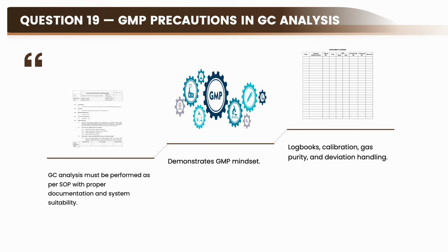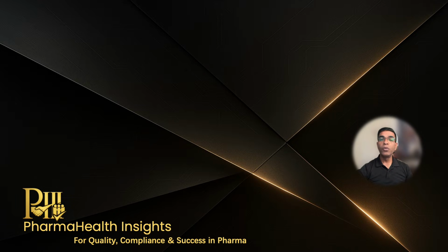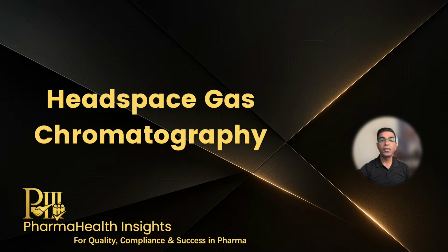Any abnormal observation must be investigated as per the deviation or incident reporting procedures. This answer will show that you understand quality culture, not just the analysis. Now the interviewer will move towards advanced GC applications.